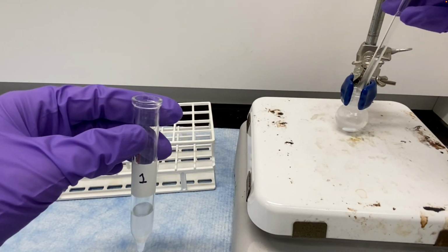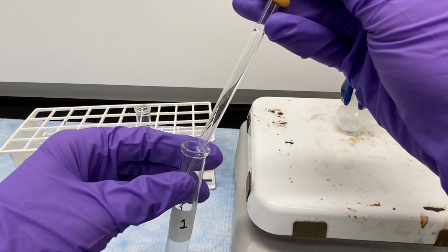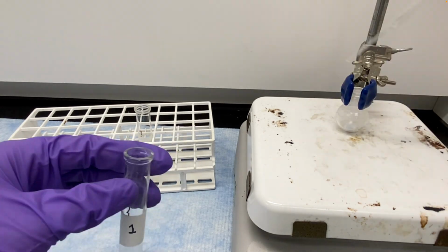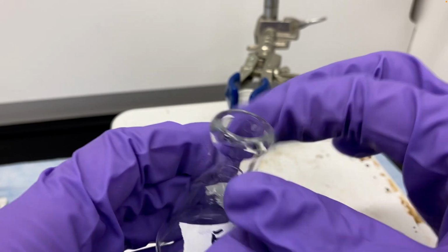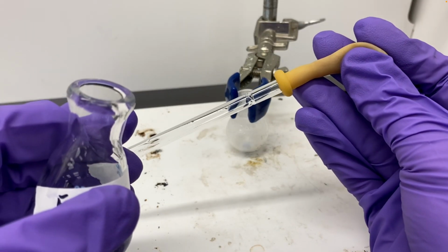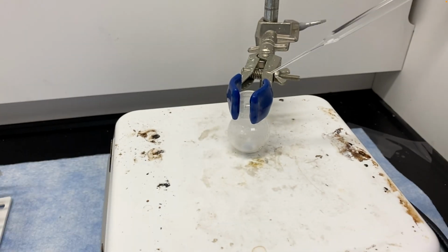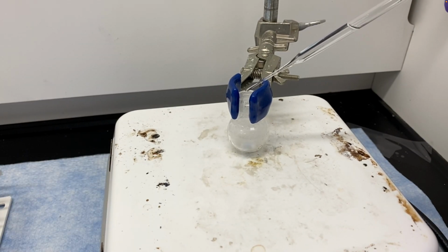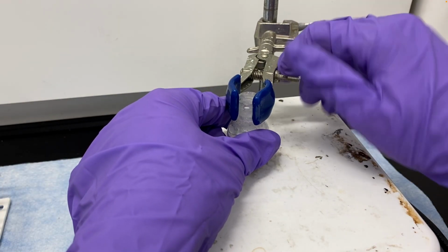Just the whole thing. There's still going to be some stuff dissolved in our round bottom flask, so to try to get as much as we can and clean that out, you'll add a little ethyl acetate to the round bottom flask and swirl it. That's just trying to get all the extra stuff in that flask out of it and into the centrifuge tube.